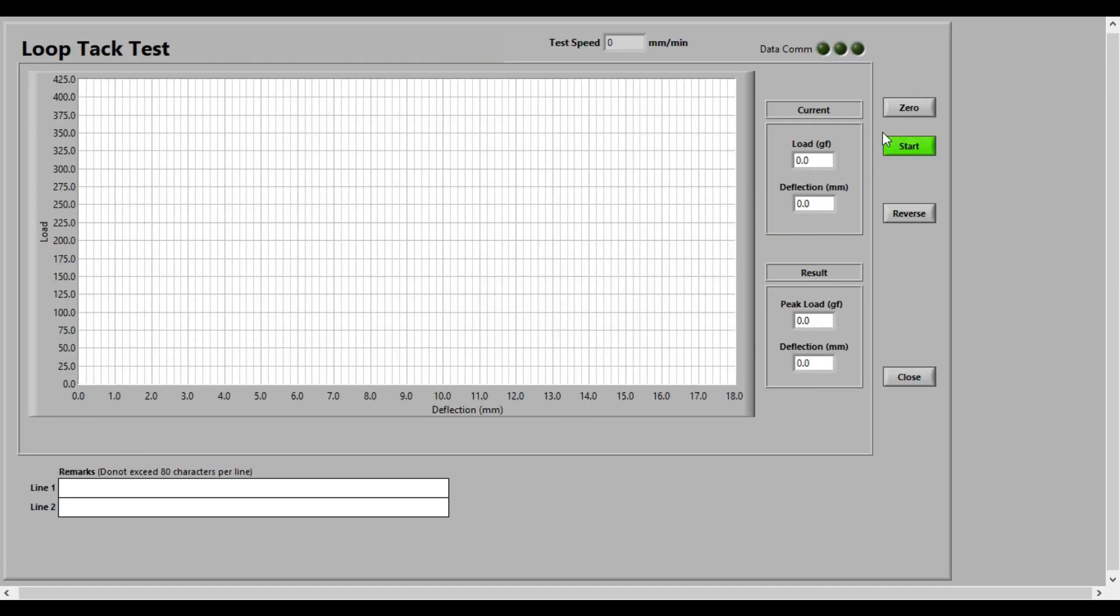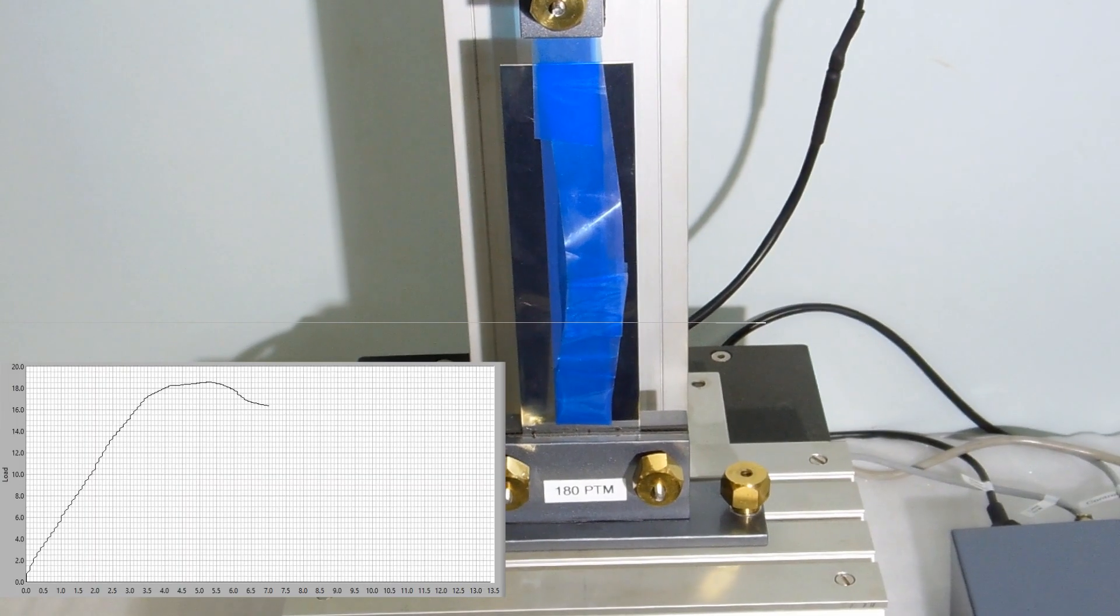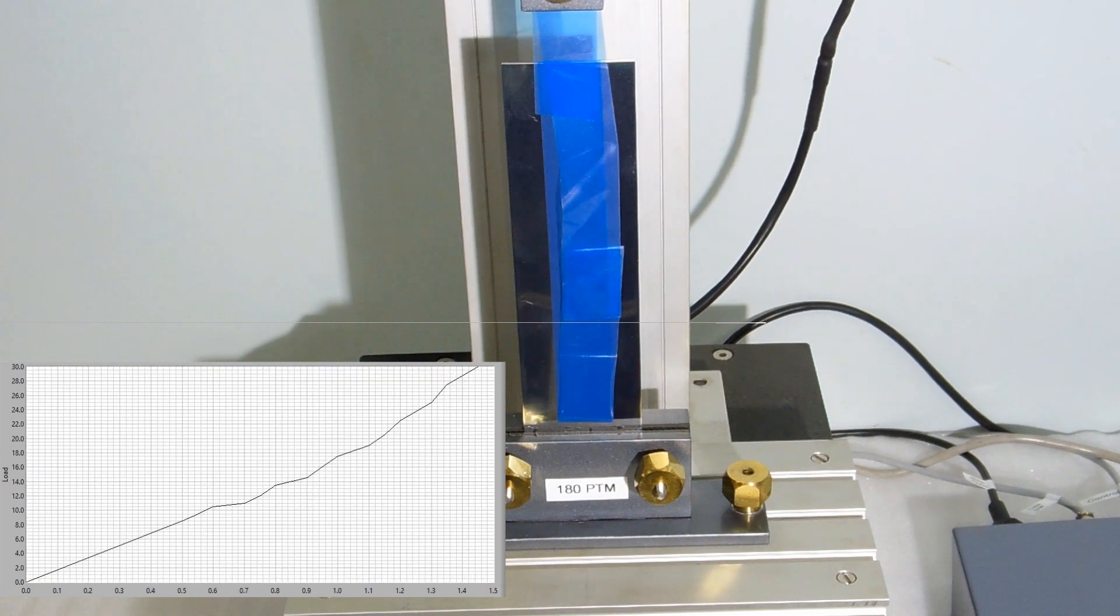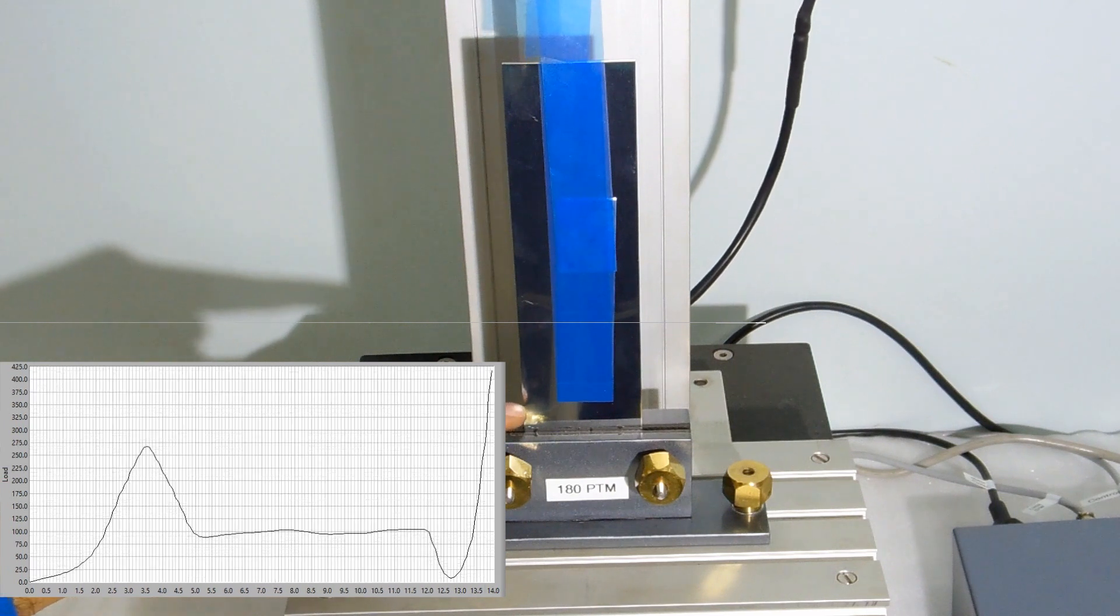With the sample slightly loose, press zero button, then press start. The top grip will start moving upwards and pull the sample. You will soon see a graph on the monitor.